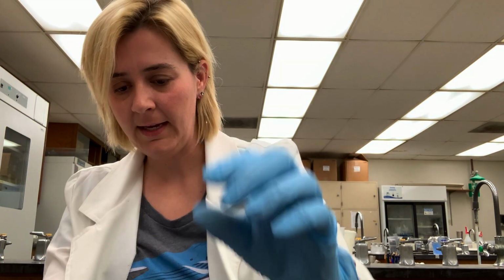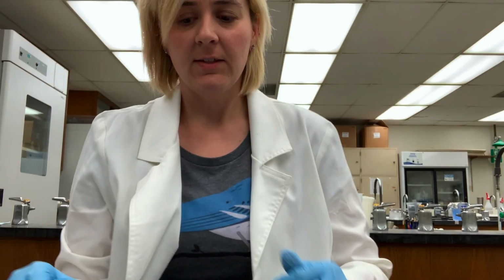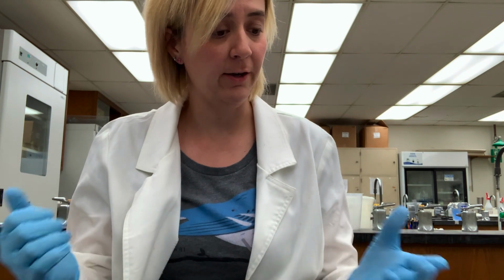So I've got a loop full of bacteria, and again, spread that out on my slide, and I'm going to allow everything to air dry.